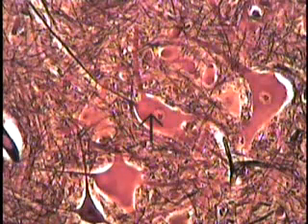The same field of cells seen at increased magnification, showing the cytoplasmic extent of these cells drawn out into these large processes, very irregular in shape. And within the center, usually, this light clear vesicle, the nucleus, and contained within this particular cell, the nucleolus, as it is present in this particular nerve cell here. Nucleolus, nucleus, and then surrounding cytoplasm.